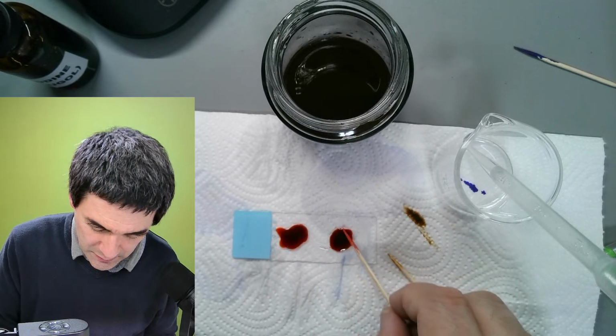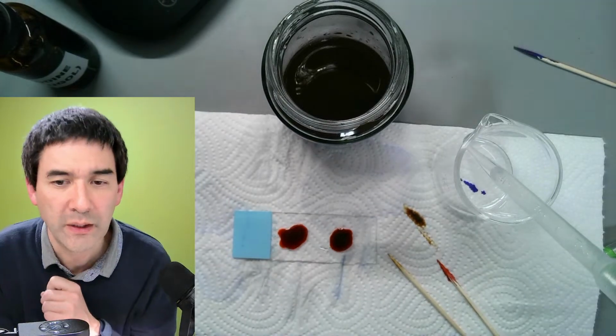Okay. And then, yeah, I wonder how this will actually look. Okay.